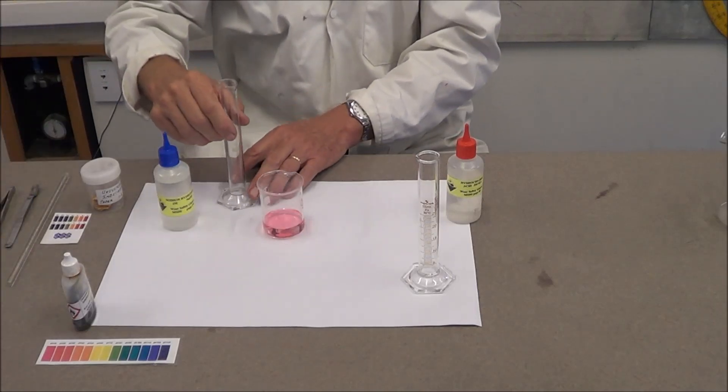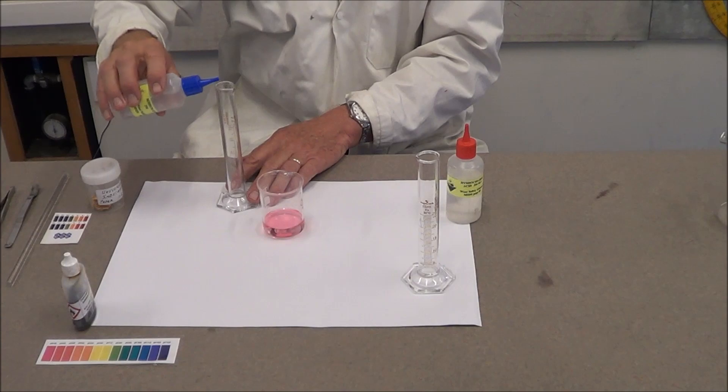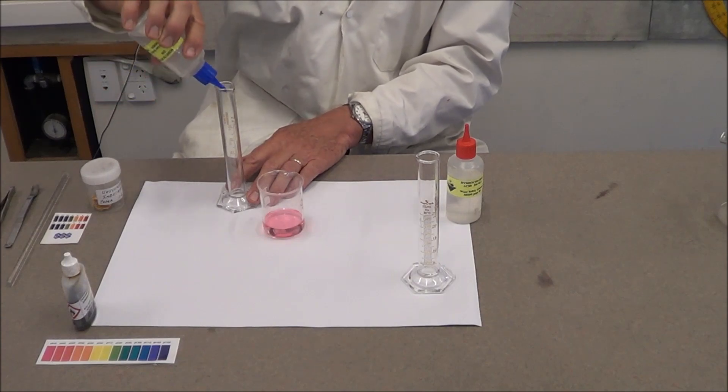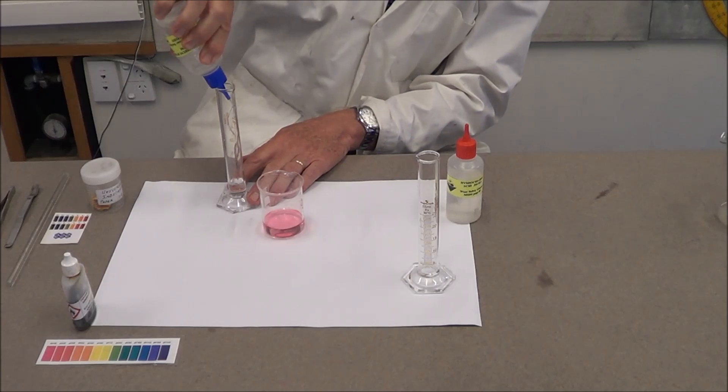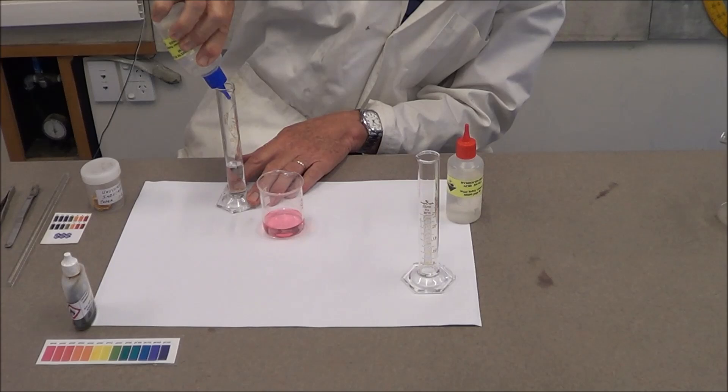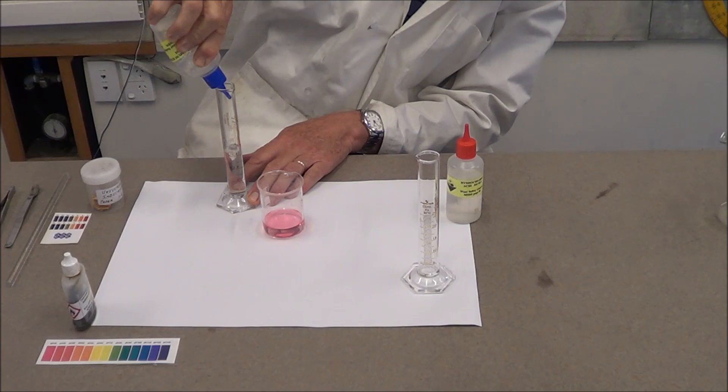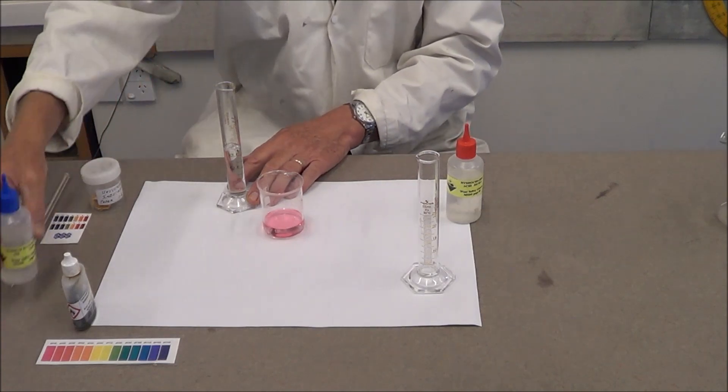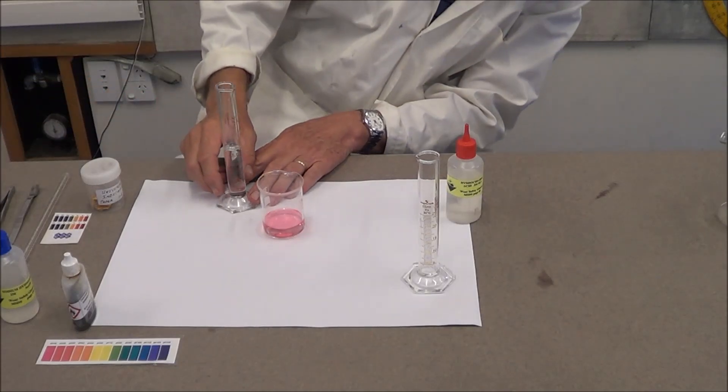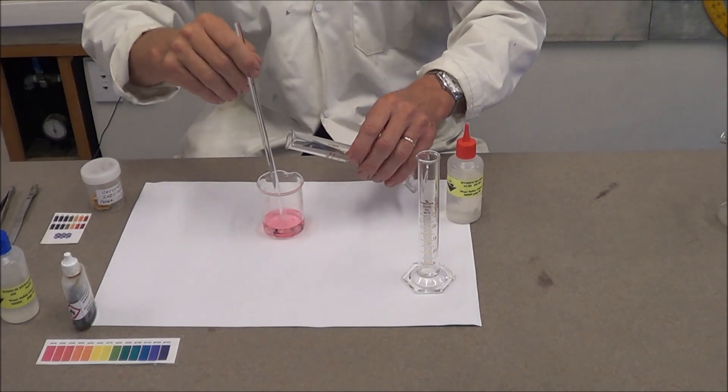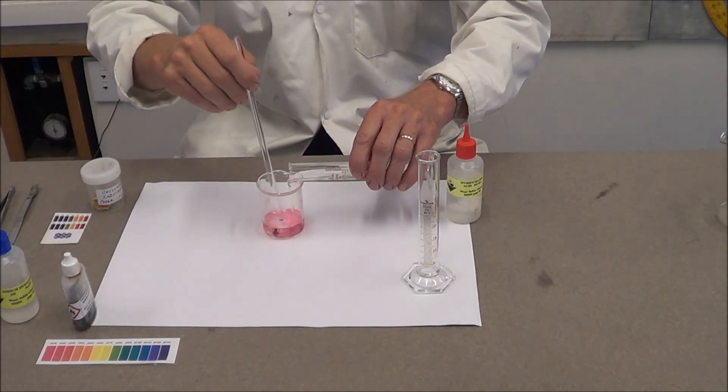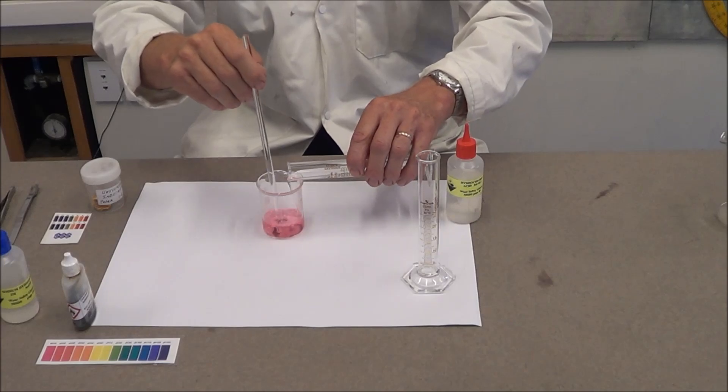We start our neutralization by adding most of the required sodium hydroxide. So I'm going to add 18 mL, ensuring that the meniscus sits on the 18 mL line at eye level. Add the sodium hydroxide gradually and note any color changes that occur.